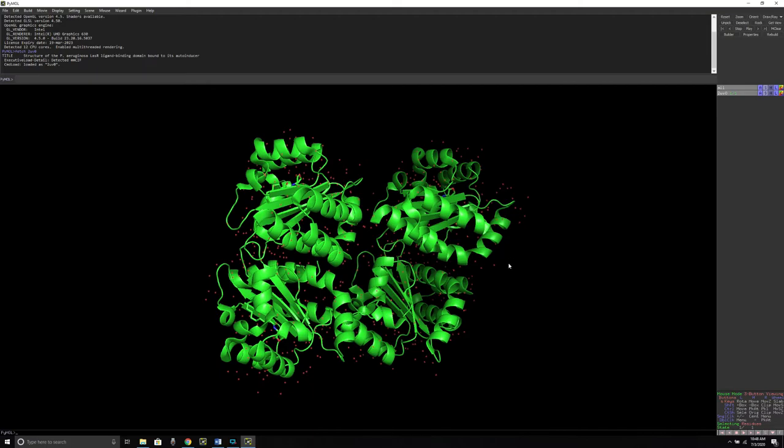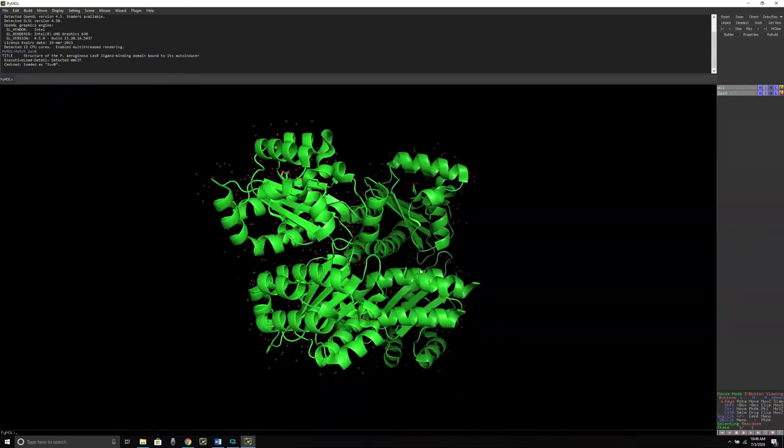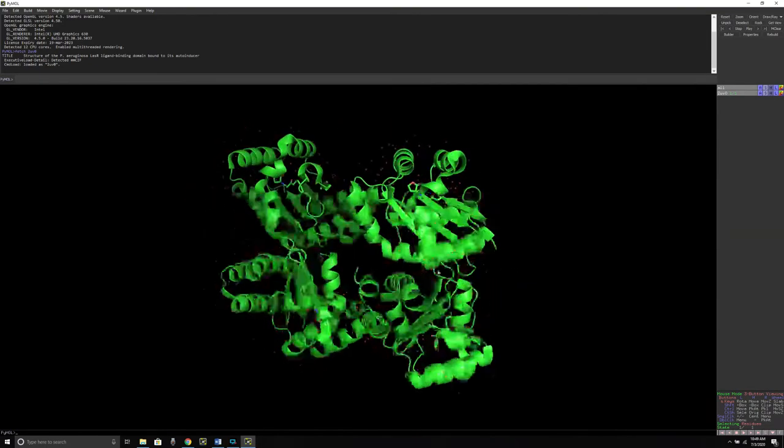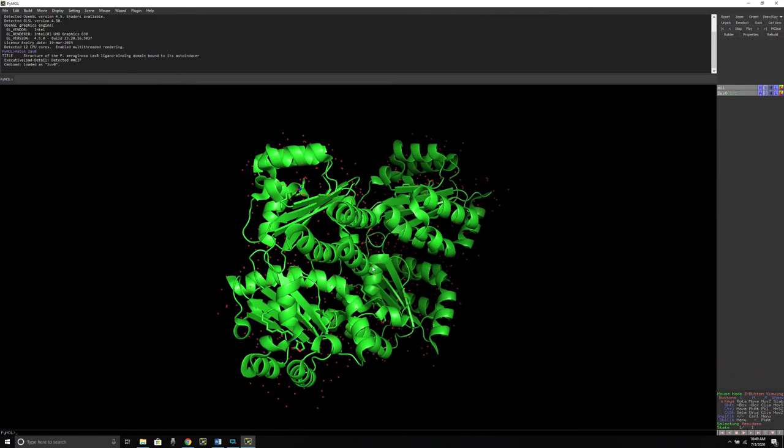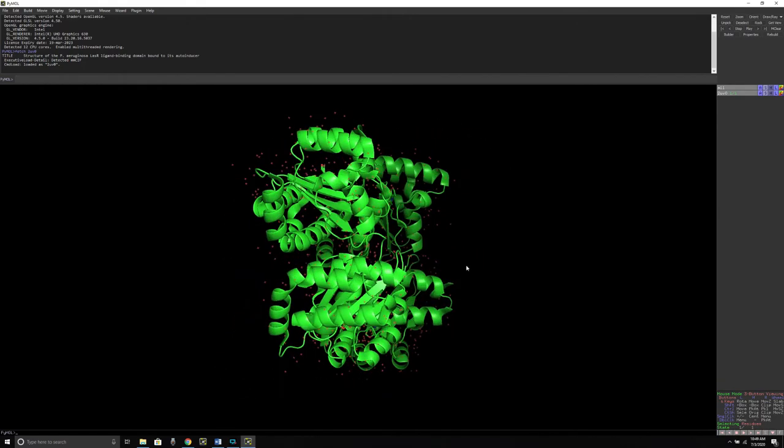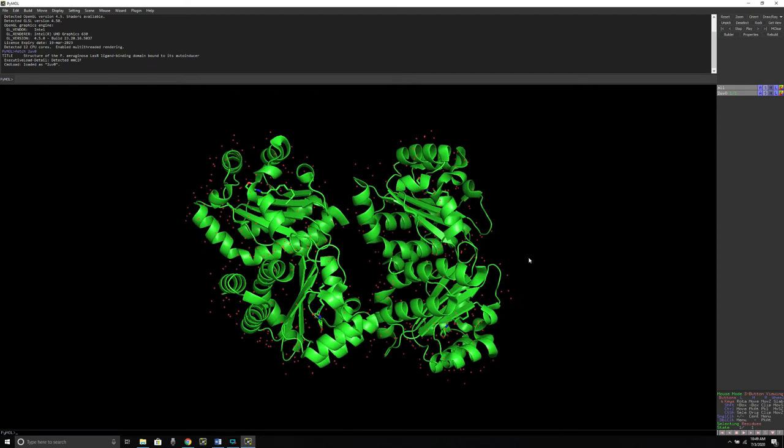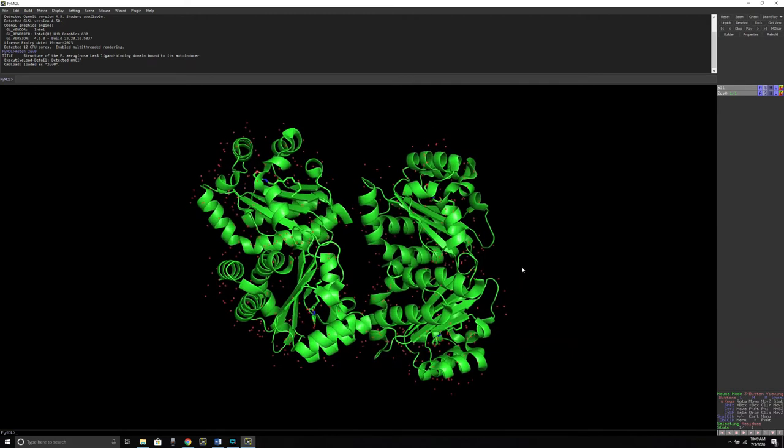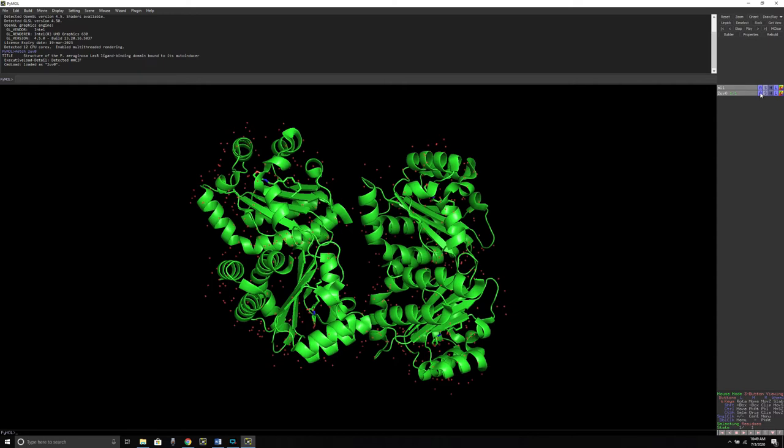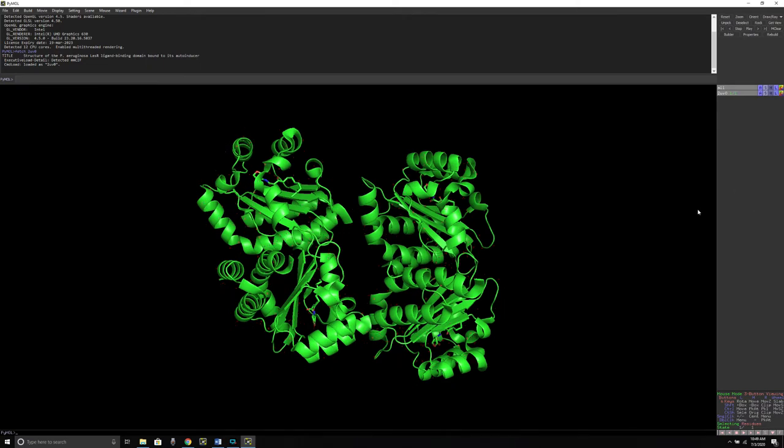In my case, it is a tetrameric protein and I know that all four domains are similar and they all contain one ligand molecule. What I'm going to do first is remove these red dots. These red dots are the water molecules. For that, I'm going to go to the object menu panel which is present on the right side, go to the A action command and then remove water. Immediately you will see that those red dots are no longer available.